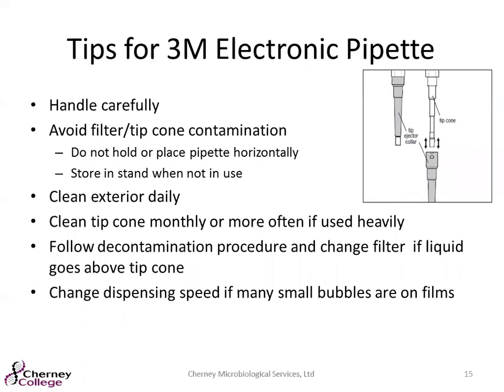Here they do have those filter tips in those cones, so you want to avoid that contamination. Again, once you pipette up sample, don't hold it horizontally. Always use the stand that it comes with. We recommend at least cleaning it daily, but make sure you have good cleaning practices, that you know they're effective, and that you stick to them. Clean the tip cone monthly or more often, depending. It all depends on use and what you're using it for.